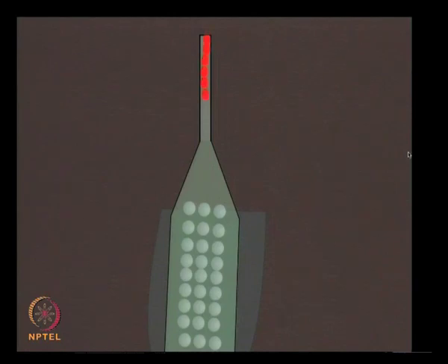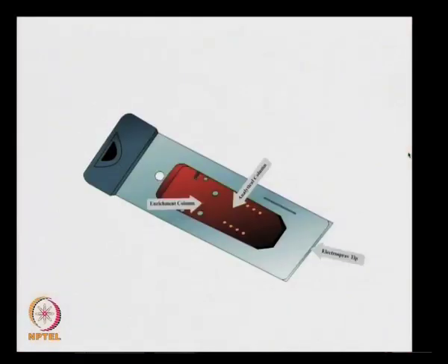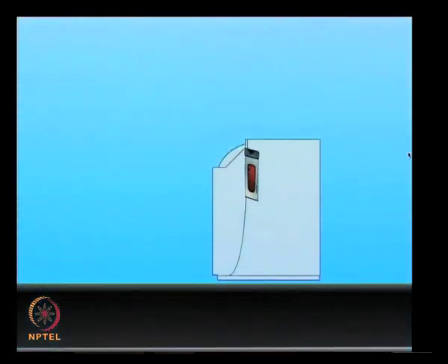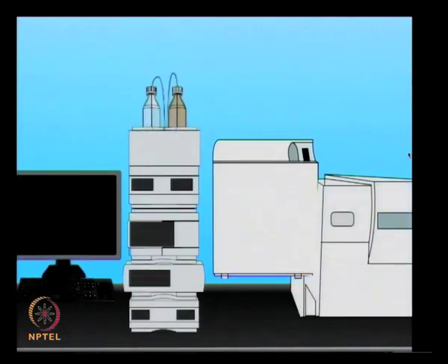Another important component of this technology is the HPLC-Chip MS interface. A chip is inserted into the interface which mounts on a mass spectrometer. This design configuration ensures that the electrospray tip is in the optimal position for mass analysis when the chip is inserted in the mass spectrometer.